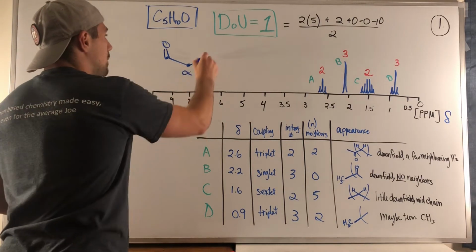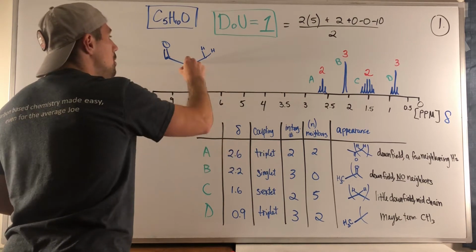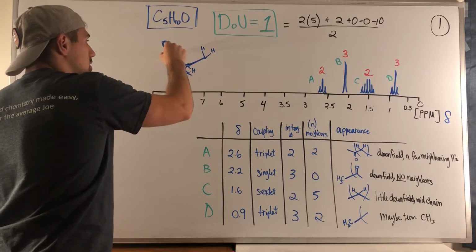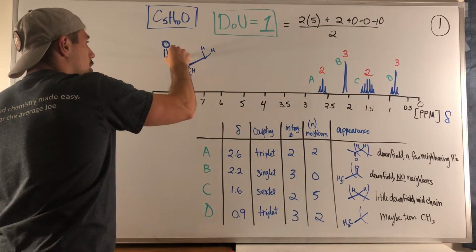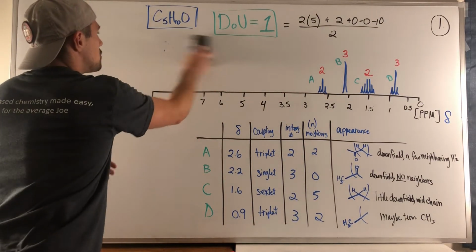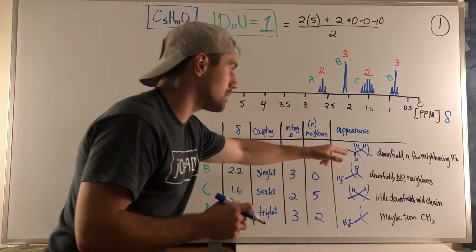So if we had a carbon chain, this is a situation where I have 2 hydrogens here, which would be my integration of 2, with neighbors on one side but none on the other. And because this electronegative oxygen is sucking electron density, not just out of this carbon but even the carbon next door, it would de-shield that carbon and make its signal appear more downfield. So that's why initially this column can be wrong. It's kind of your initial hunch. I think being alpha to a carbonyl makes sense.